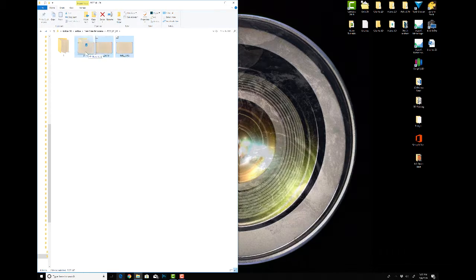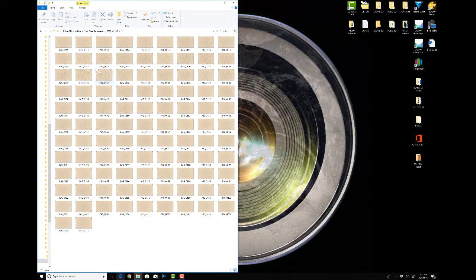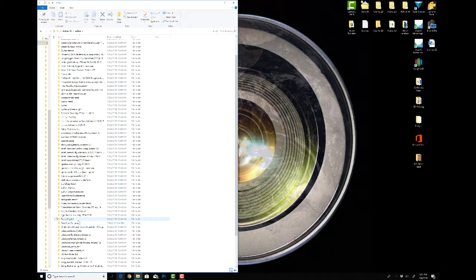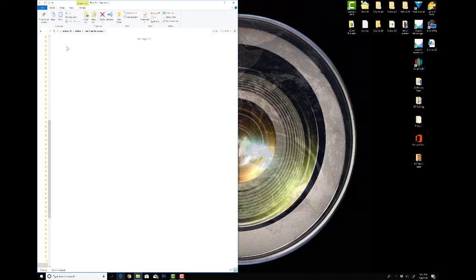So what you can do is just move those two. Actually, one's 212, one's 312. For some reason it didn't take the front and back, but this is an easy enough fix. You could just move those files right over. So we're going to move 212 and 312, which both should be over here, into that folder.